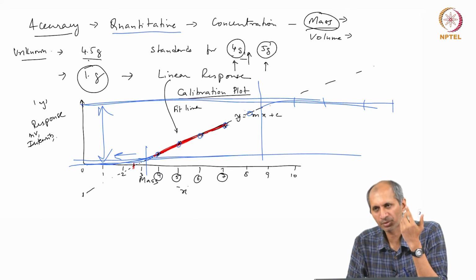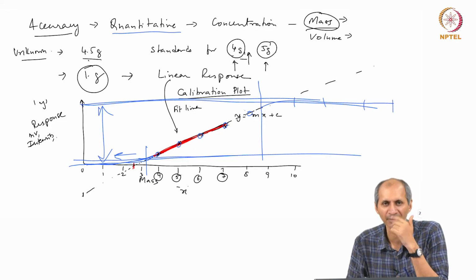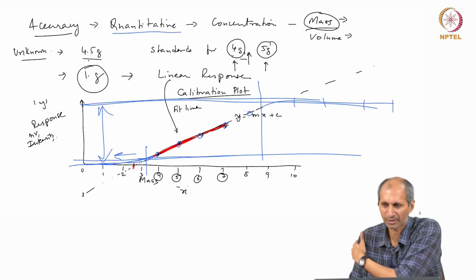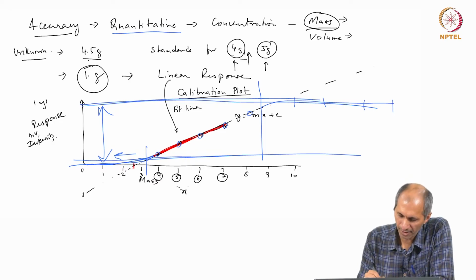Sometimes there is no standard established worldwide, so you have to prepare your own standards, and that will of course be questioned by other people because it is not accepted worldwide. We will come to that. Okay. So, this is the calibration plot. The calibration is a check.